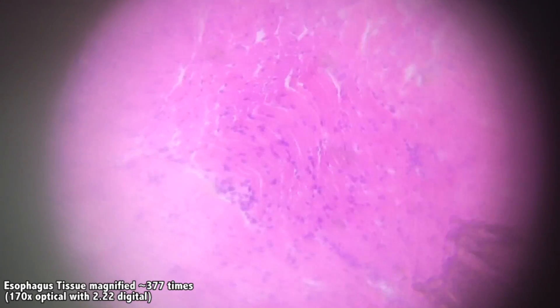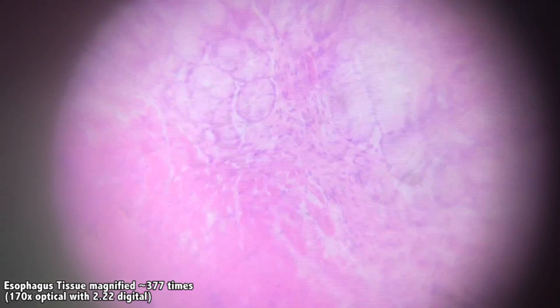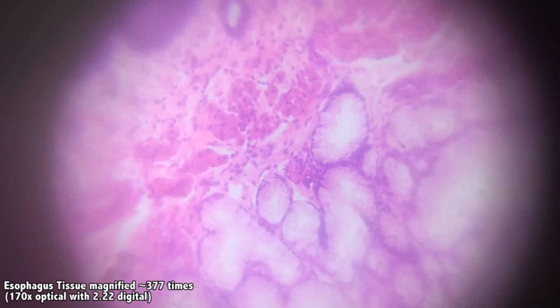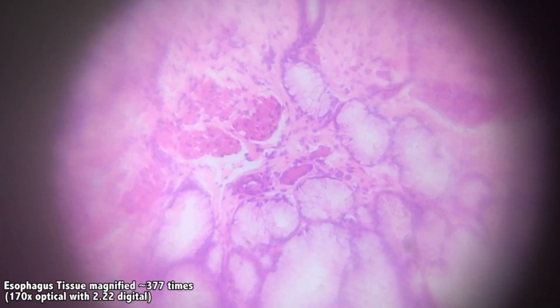What really makes this so exciting is how versatile it is. This is a full-featured portable microscope that's simple enough for a 10-year-old to satisfy their curiosity, but also powerful enough to satisfy the needs of a professional. With three different levels of optical magnification — 30, 50, and 170x at 1.5–2 micron resolution — you can use this as a macro view or as a microscope.